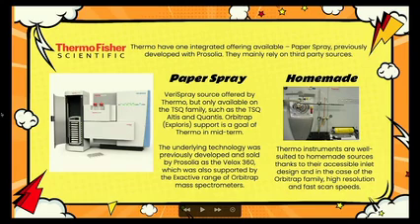And also, I suppose, there tend to be quite a few people that have an older Orbitrap lying around after they've upgraded. So there might be an old instrument at the back of the lab that, if it does get broken by doing some sort of crazy experimentation, it's less of an issue. They're not losing their main workhorse. So there tends to be some interesting stuff, and as I say, I would encourage you. I mean, in total, I think at the last count, there's probably like 300 or 400 different ambient techniques in terms of acronyms and things.